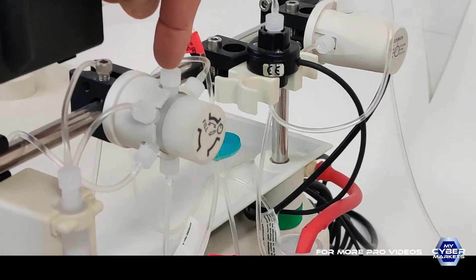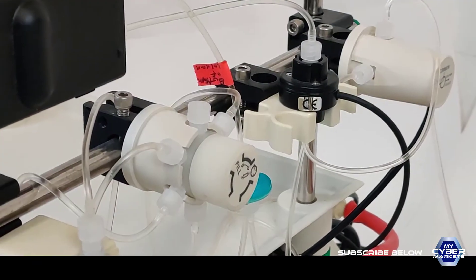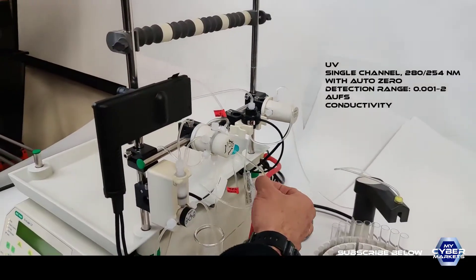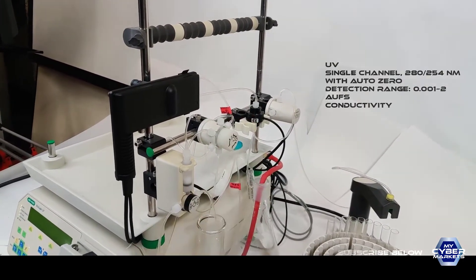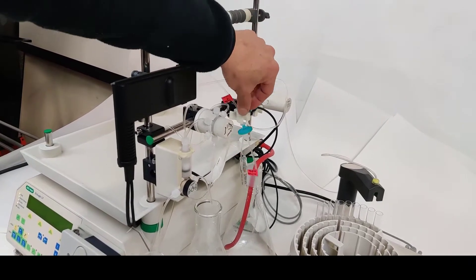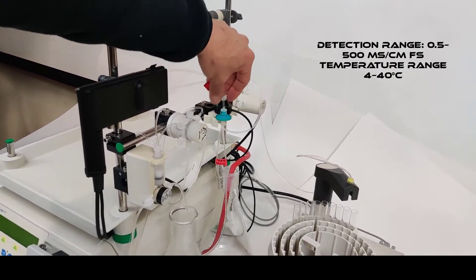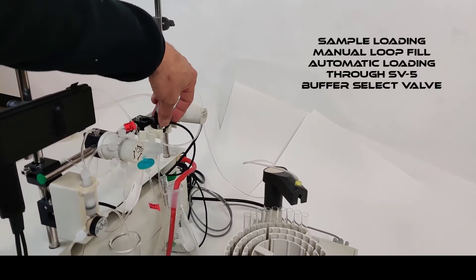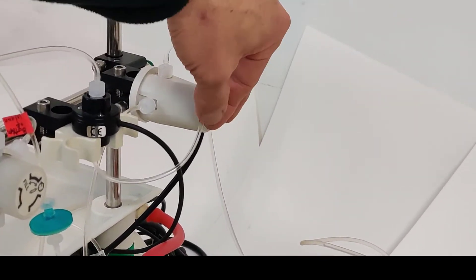Up here, this port is for the injection. You inject it and then you turn it manually to fill the sample line with your injection, and it continues into the process. Right now here will be the column — for this demo we are using just this filter. You have the flow, conductivity flow, and here we have the diverter valve.